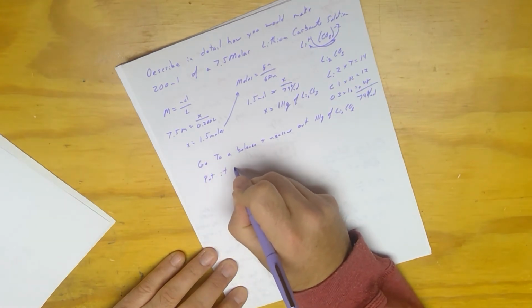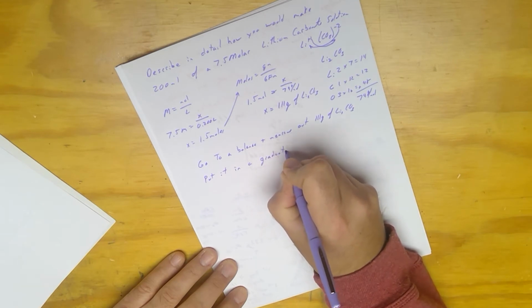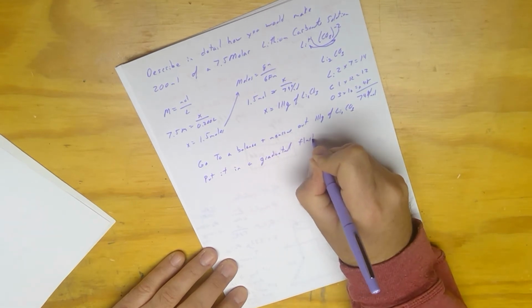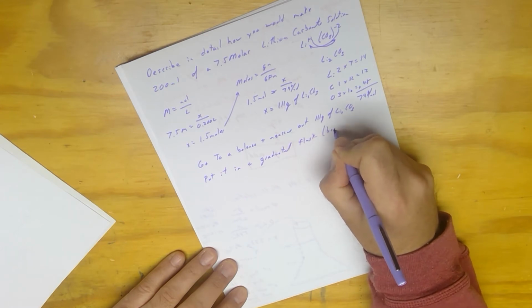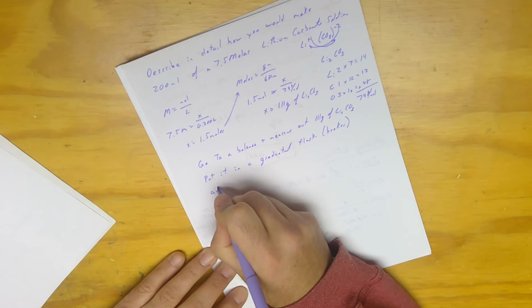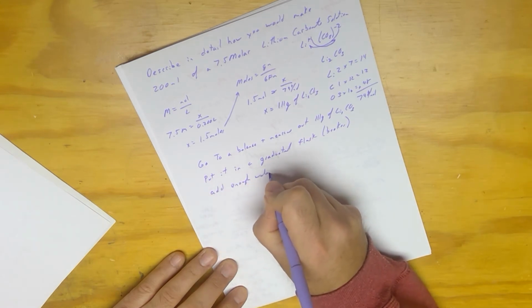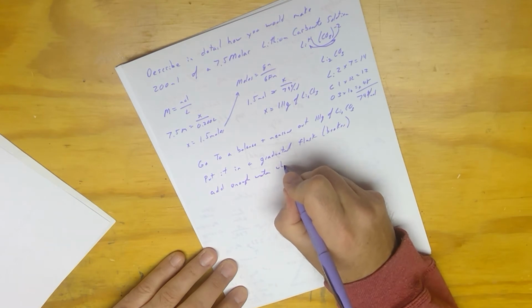Put it in a graduated flask. You could say beaker, I guess. And then add enough water while stirring.